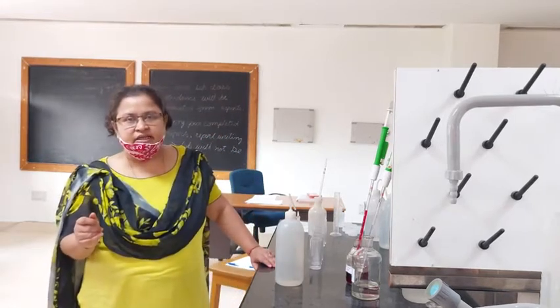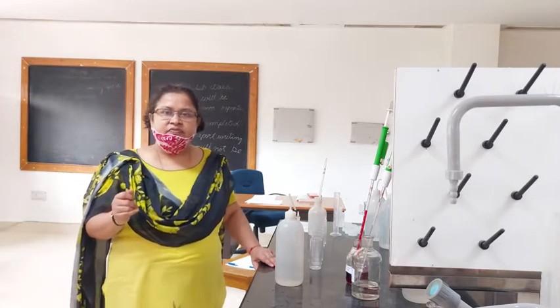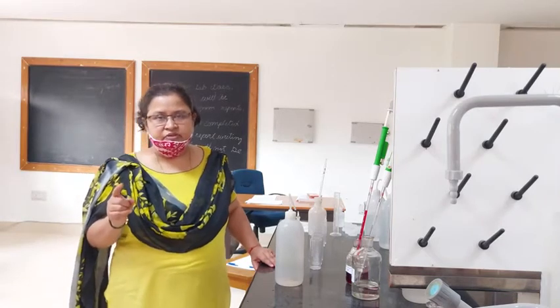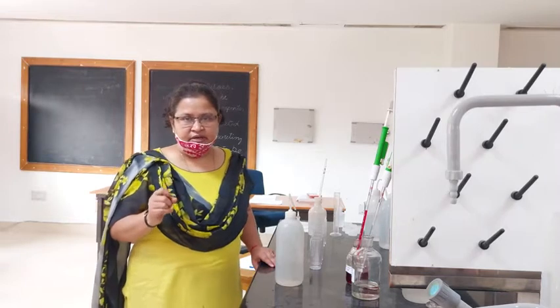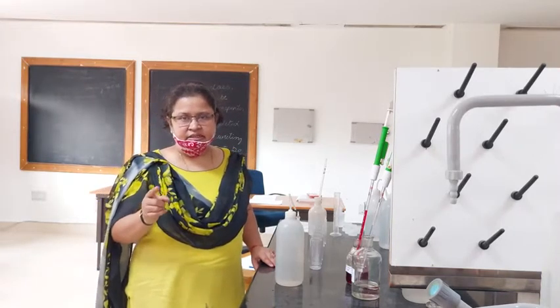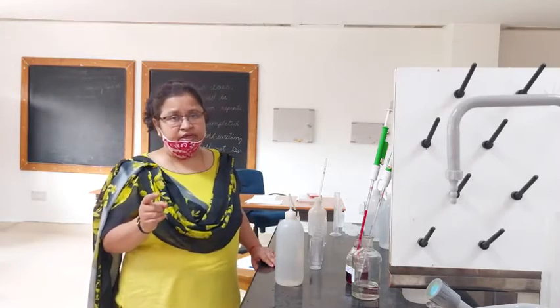This method is valid in the concentration range 0 to 1.4. So we select a few standards in this range. One is the blank, which is 0. There we have to take 50 ml distilled water. Then the first standard is 0.4 milligram per liter, the second standard is 0.8 milligram per liter, the third standard is 1.1 milligram per liter, and the fourth standard is 1.4 milligram per liter.